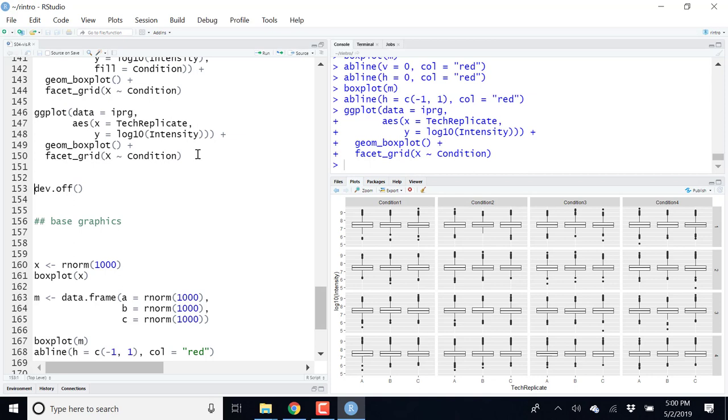To give you a hint of how, with the basics that we have seen today and yesterday, these basics being the concept of a two-dimensional data or a vector that we can subset with the square bracket operator, these concepts can be reused for more complex data types, mass spectrometry and proteomics, but it could also be, you know, microarrays, RNA-seq, and so on. So I want to demonstrate that a little bit tomorrow.